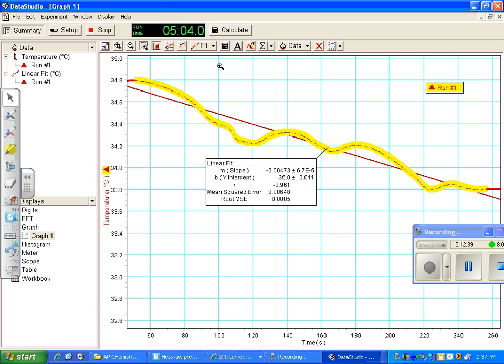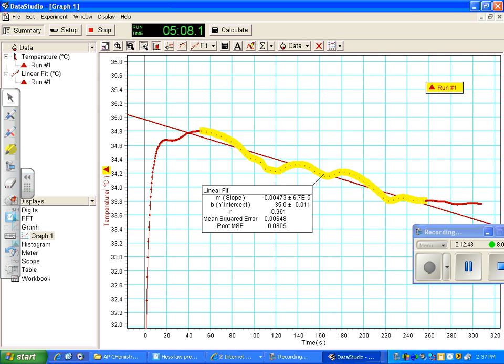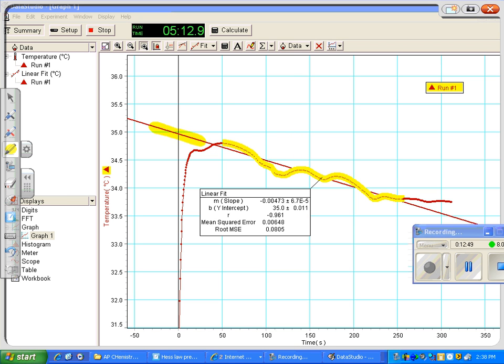It'll trace back, and then if I hit the minus, it'll walk me back out. So I'm hitting the minus sign. See how it walks me back out, and I can actually see where the line crosses over. I can see right here where the line crosses over the Y. And yours, I guarantee you, yours will be more linear tomorrow. But you can see, right from the data, so when you print your graph and you export your picture, it should be exported like this, where it clearly lists what the y-intercept is. That is your T final.